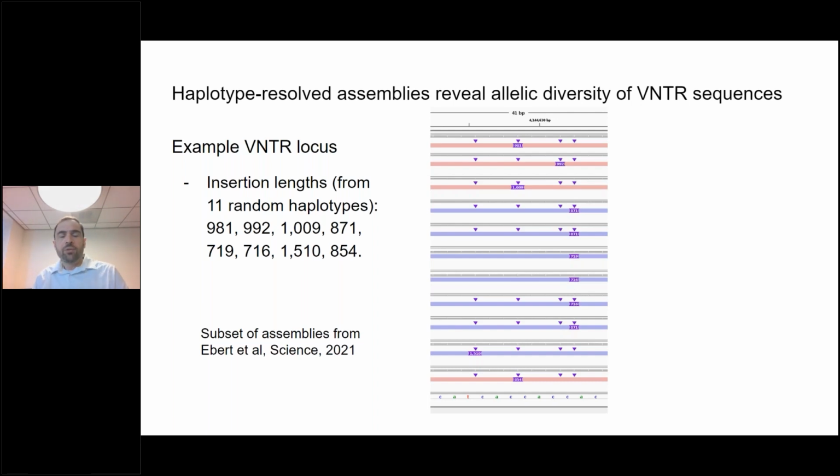And unfortunately, when you're sequencing a population of individuals, you want to be able to count, say, the allelic frequency of a variant in a population. And so you need to be able to merge variants across assemblies. So typically what is done in variant merging is to find variants that are of similar length and similar position and essentially count them as the same.